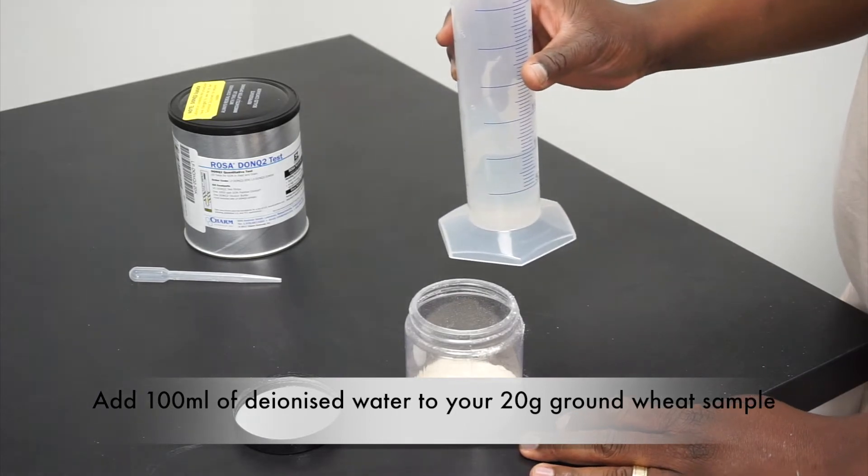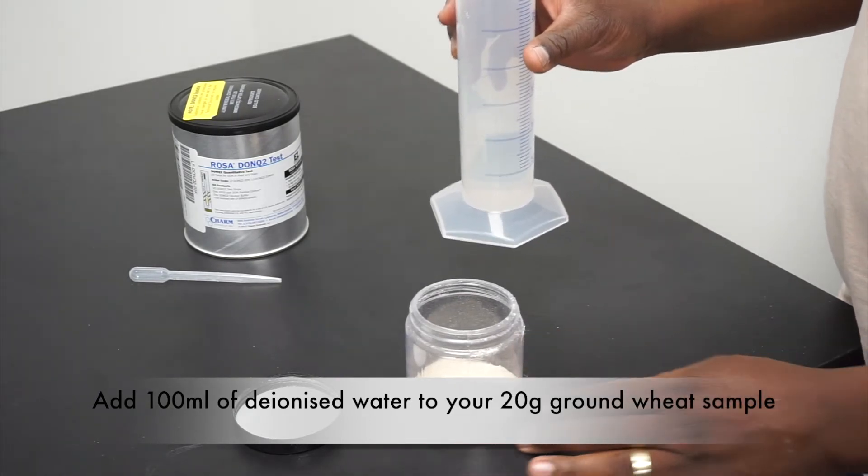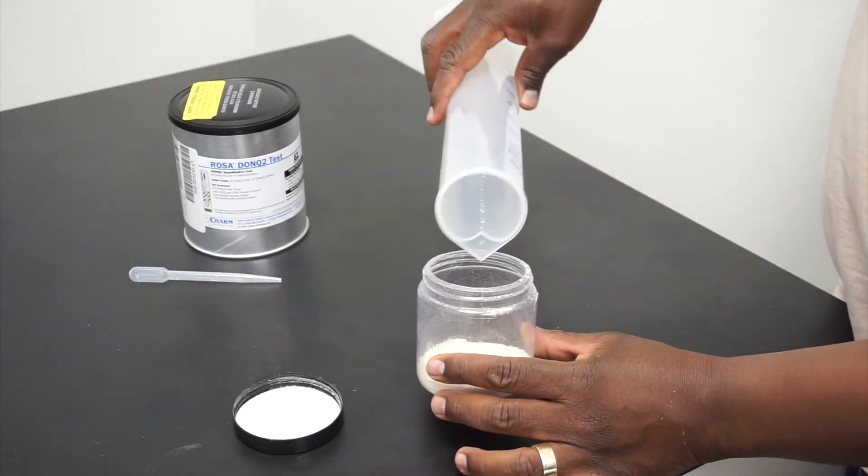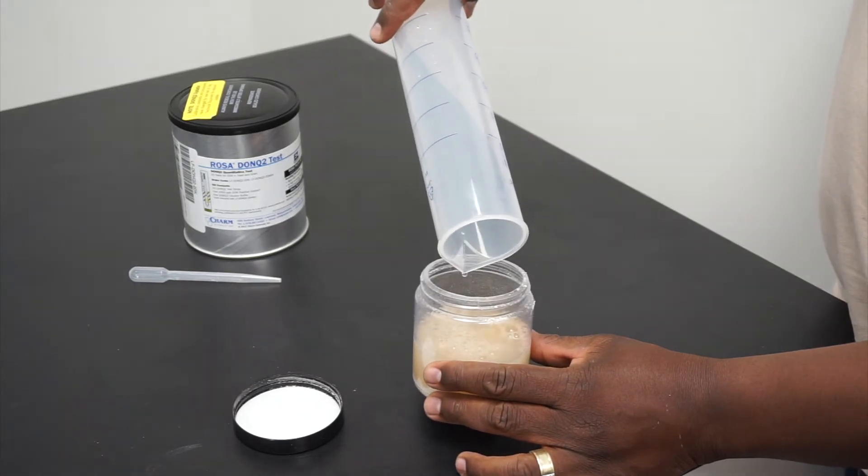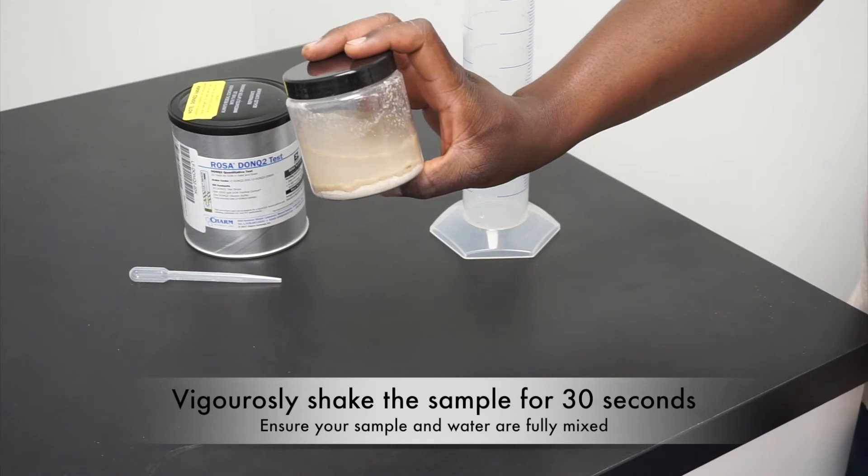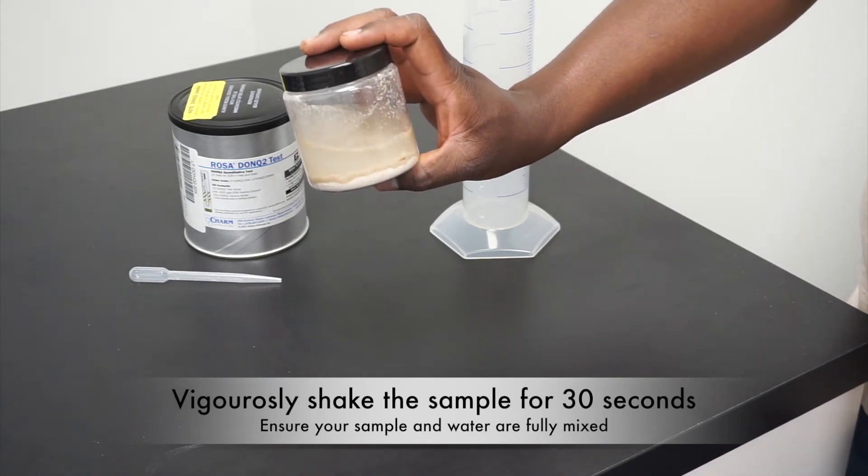Add 100 milliliters of distilled or deionized water to 20 grams of milled sample. Give your sample a vigorous shake to ensure that your milled sample is thoroughly distributed in the water.